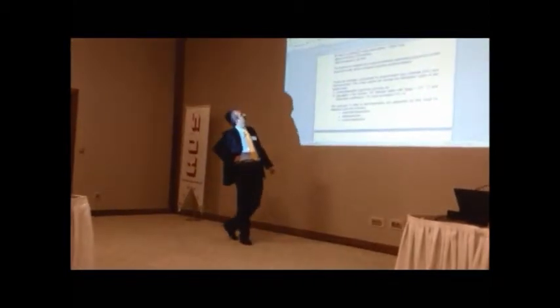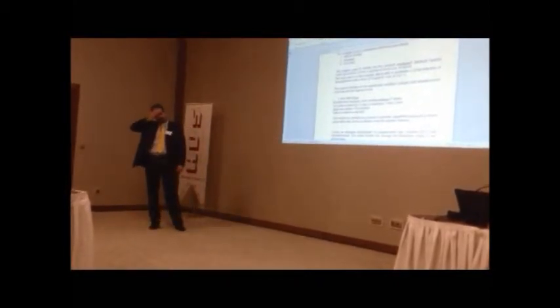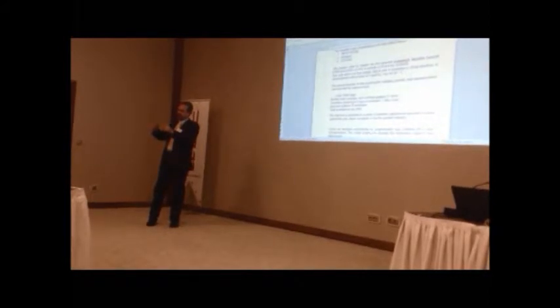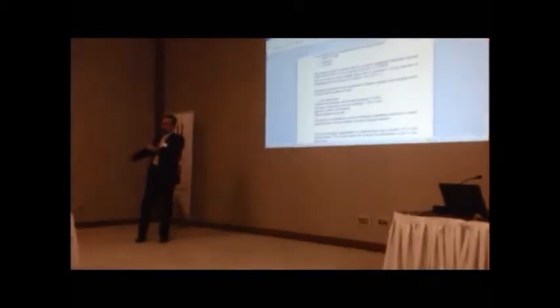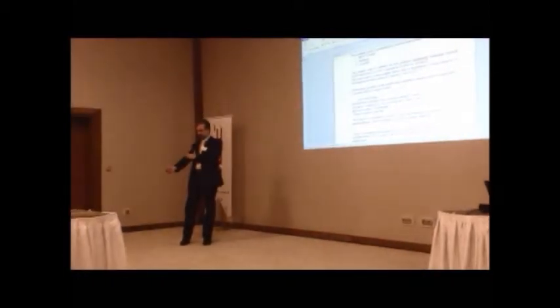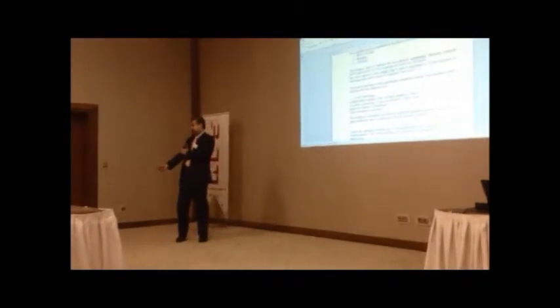10,935 bags of infusional bags, these that you use at the hospital, the plastic bags that contain the disinfectant, that when you have a burn, you put on the place you have burned, and it helps to disinfect. So it should be sterile.